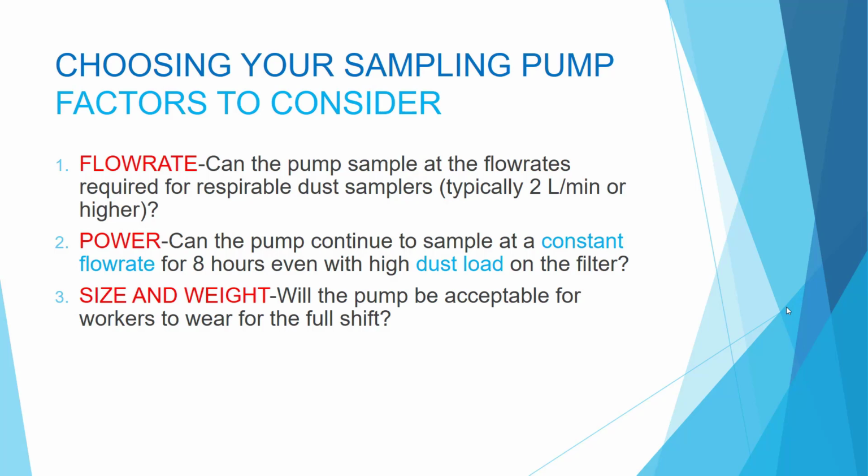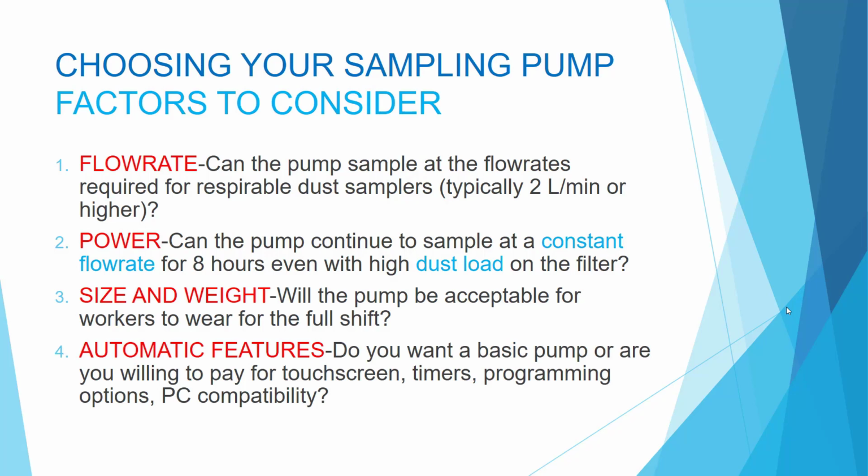The size and weight. Will the pump be acceptable for workers to wear the full shift? And automatic features. Is your budget limited to a basic pump? Or can you purchase a pump that offers the convenience of intuitive touchscreen operation like your cell phone, along with a timer and programming options?